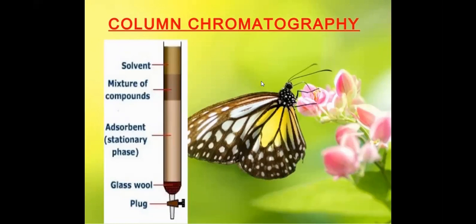What is the technique actually? What is the principle involved behind column chromatography? What is the methodology? If we see the principle of column chromatography, as we know, chromatographic separations are based on two principles, that is the partition coefficient as well as adsorptivity.